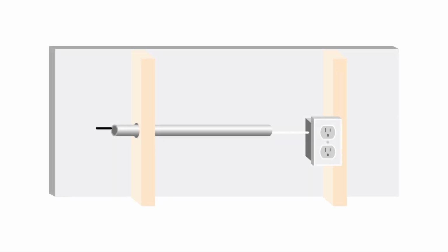So let's look at common sources of AC magnetic fields inside the laboratory. The first and obvious source is wiring and outlets inside the walls. Wiring inside the walls for new construction or renovations where there's a complete tear back of all existing electrical equipment and new wiring has been installed.